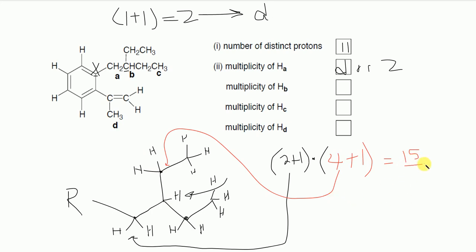Okay? And then you would put that. There's no like thing for it. What she would write out in letters either this would be 15, and so this would be triplet, and then this is 5. But this doesn't really have a letter for it. Okay, so triplet is for 3, but the answer is 15 for this. Okay, so I hope everyone sees how that works. So it combines both the hydrogens because they are chemically the same, and this one is distinct, so we multiply it. Everything that's distinct, you multiply them together, and everything that is the same, you add them together.